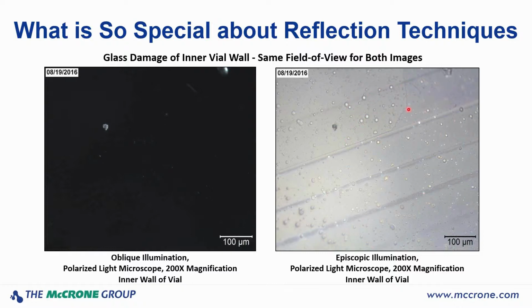You can see here a line of demarcation that is actual delamination of the glass, and you see what we believe are manufacturing marks in these linear parallel lines going across here. The only means of seeing this is by light microscopy.